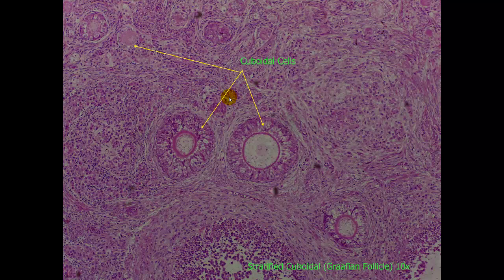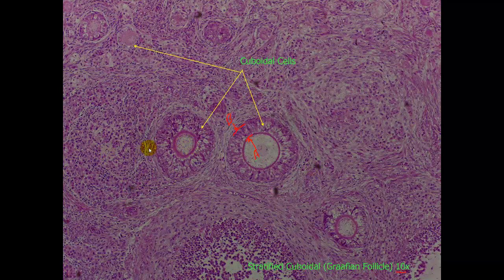Here is a slide for stratified cuboidal at a 10x magnification for the objective only. The cells that we are looking for are from here to there. The basal side is here and the apical side is here. Now, all of these white areas that we see — this one, this one, and this one here — these are all lumens.